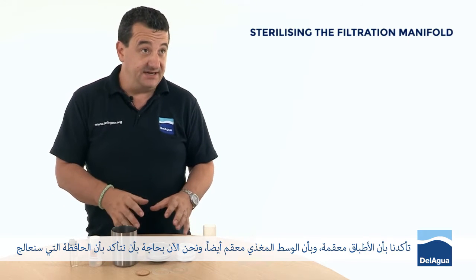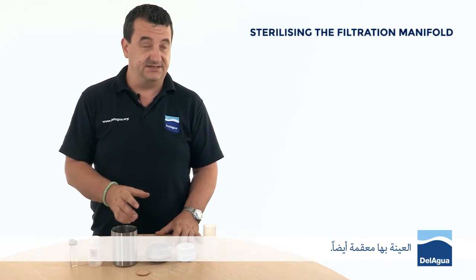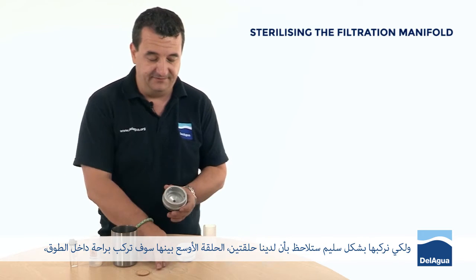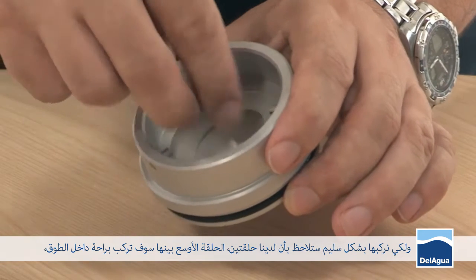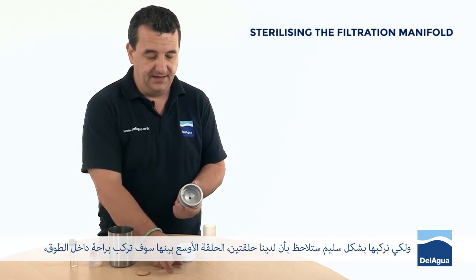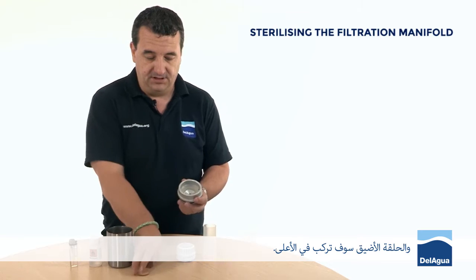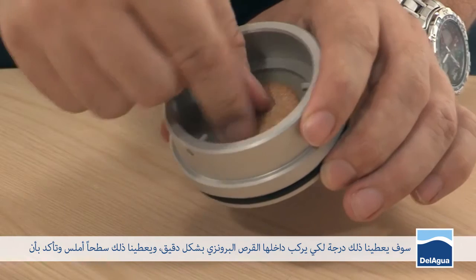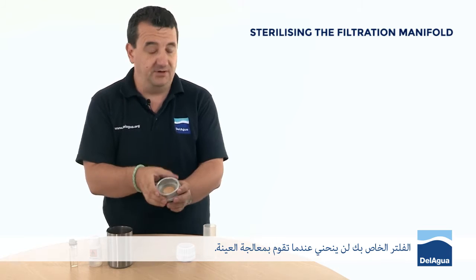We've made sure that the petri dishes and the media are properly sterile. We now need to make sure that the manifold that we process the sample with is also sterile. We need to build it properly. You'll notice we have two gaskets. The wider of the two gaskets needs to fit snugly inside the collar, and then the narrower of the gaskets needs to sit on top. That gives you a step, which this bronze disc sits into very neatly and creates a flat surface, making sure that your filter doesn't bow when you process the sample.